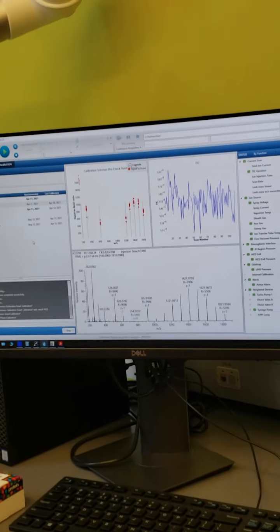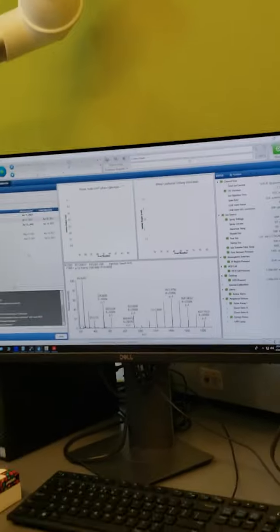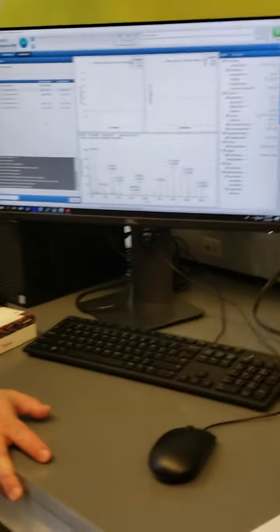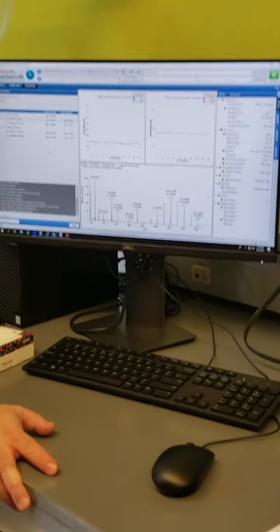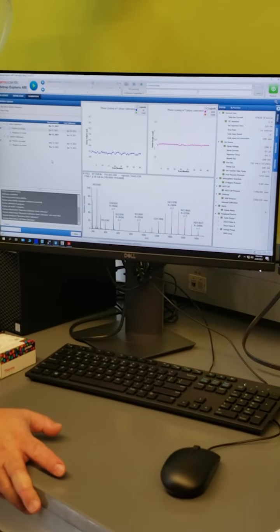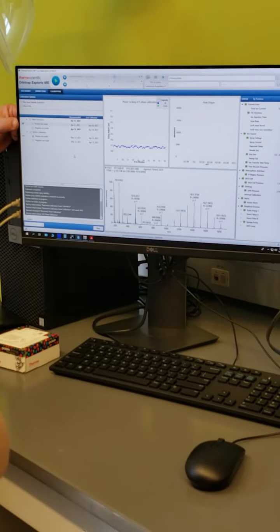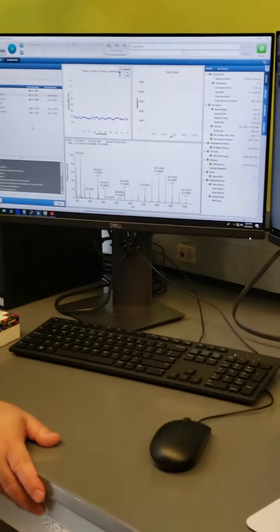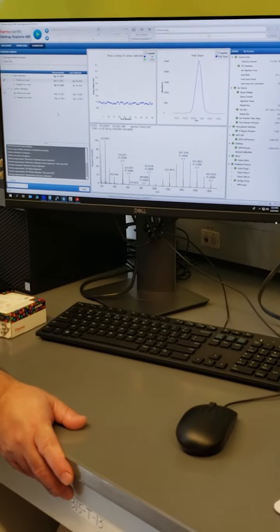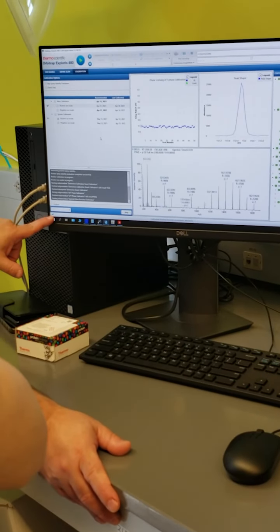It's system calibration. So that's the next step. First you did this upper one, just mass calibration, or you could click both of them and do them together. I would always recommend doing the calibration of the masses first to make sure that everything's lining up. It's going to walk through a bunch of them, and when it's done, I'll show you how to get to the advanced features.